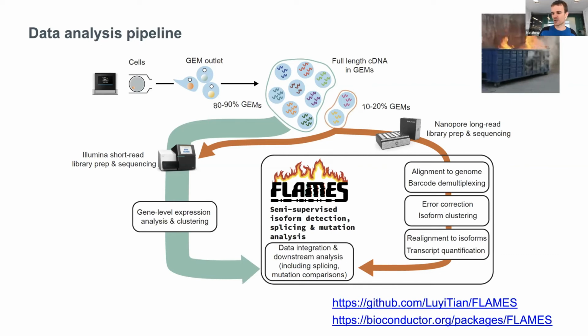So we found other tools that perform this sort of isoform identification step tend to find many, many, many more isoforms than you might think are there. And we looked at spike-in data sets where there's synthetic spike-ins, the isoform structure is well known, and some other popular methods tended to find hundreds of new isoforms in data where there really shouldn't be. So we took a more conservative approach here to cluster isoforms and also only keep isoforms that have a decent number of reads supporting them.